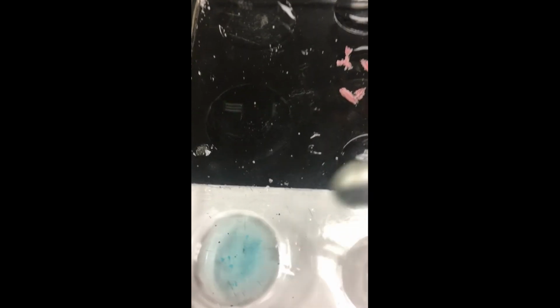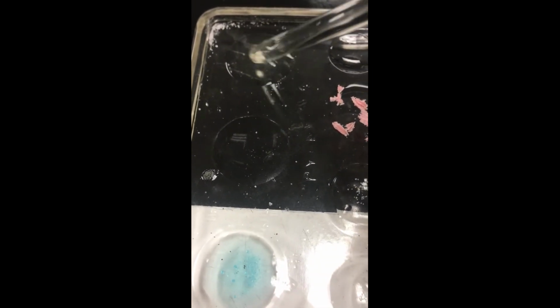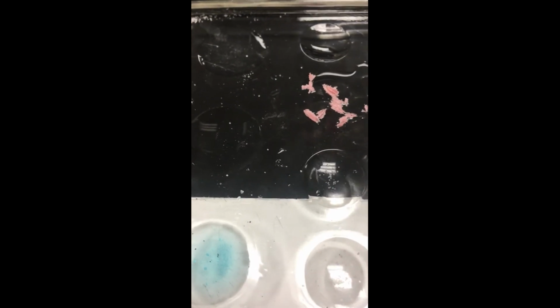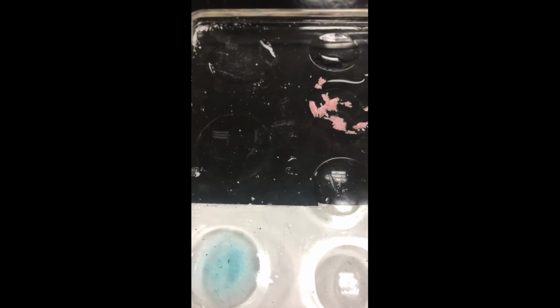So this blue color in the water means it's dissolving, and you can see my salt and sugar are now almost completely dissolved. So these three guys dissolve in water, copper sulfate, salt and sugar, and my paraffin wax is just floating on top. It's never going to dissolve.